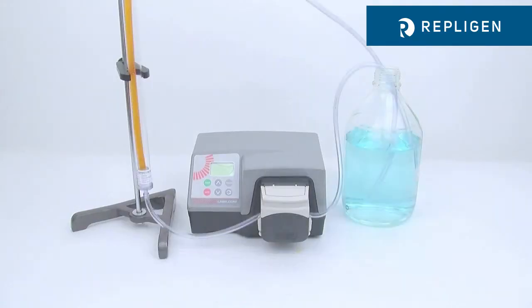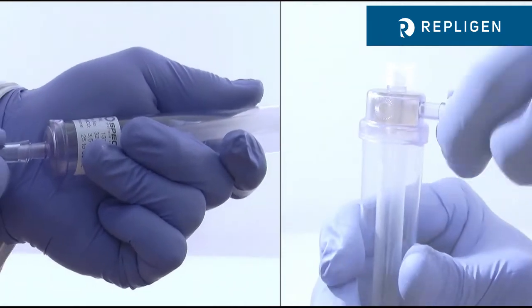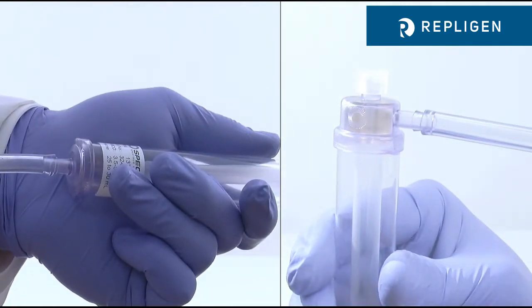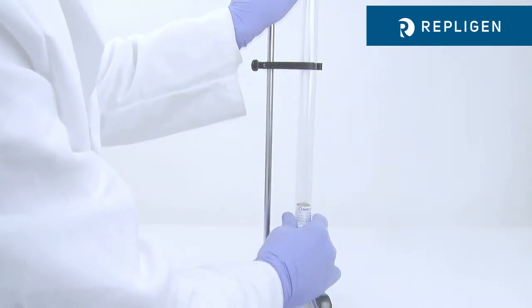Setup and operation of the Tubalizer is quick and easy. Connect flexible tubing to the lower inlet and upper outlet ports of the flow-through buffer chamber. The Tubalizer easily mounts to any standard laboratory stand or rack system.